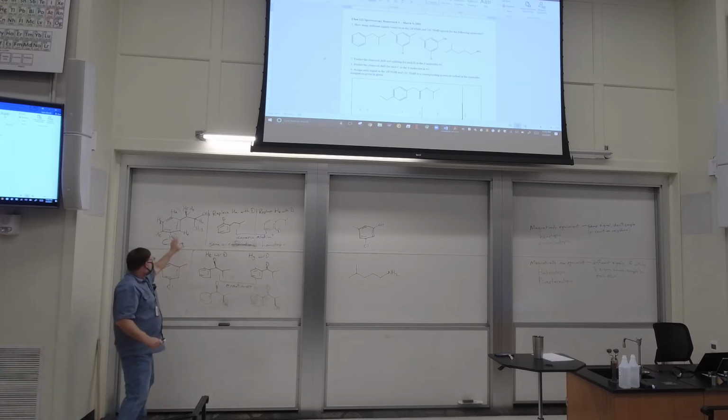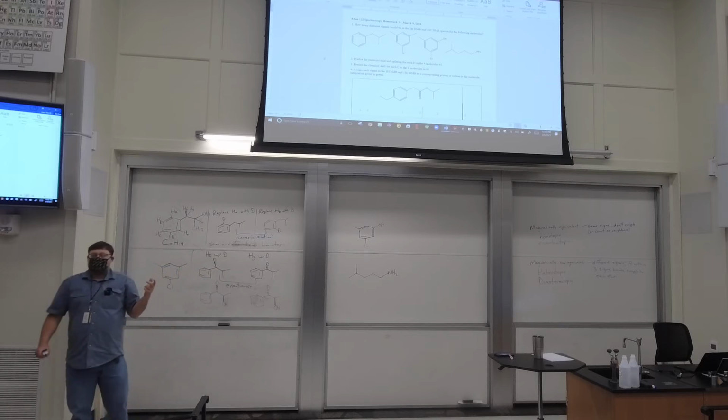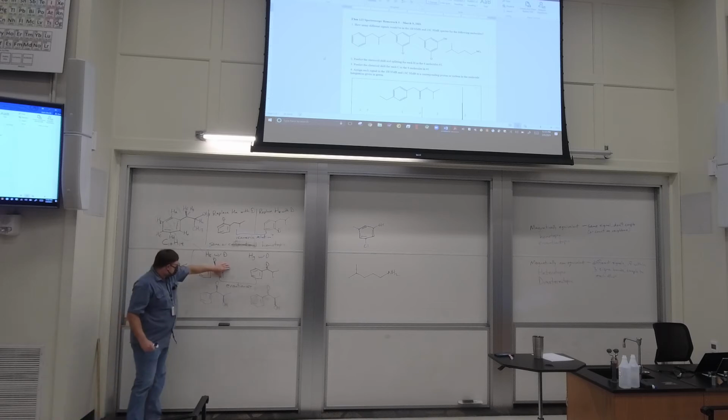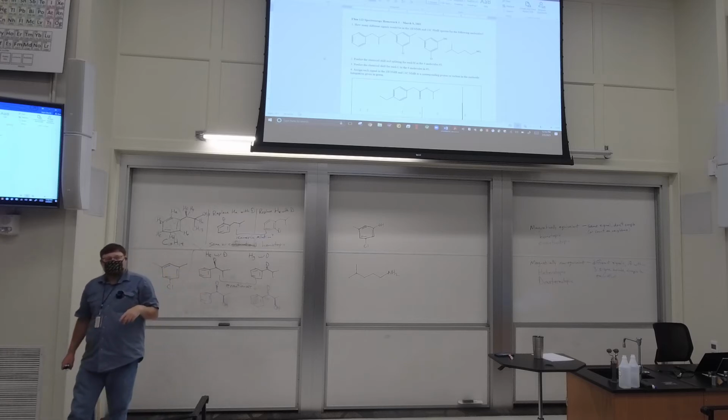On our real molecule, these 2 groups are methyls. The 2 methyls, in fact, are enantiotopic. So those 2 methyls are going to give you the same signal. All 6 of those protons will be magnetically equivalent. So these 6 on the top on our real molecule are going to give the same signal. They'll have one neighbor, so they'll be split into a doublet. Again, more on that in a second.